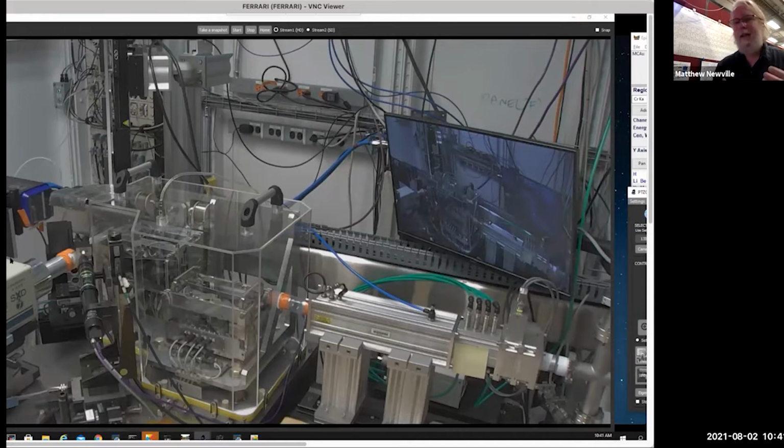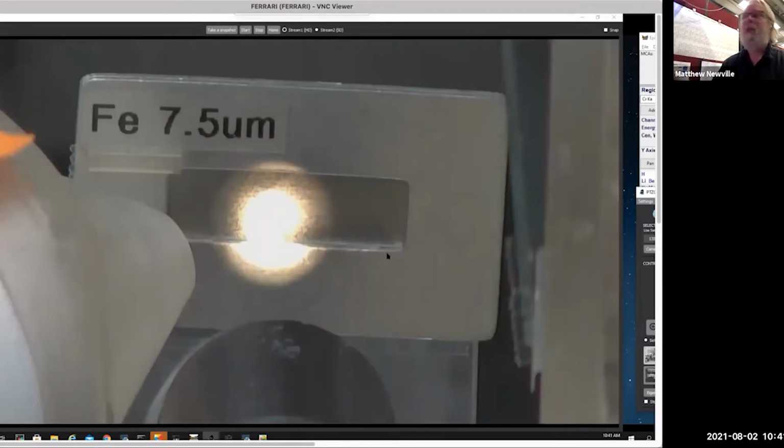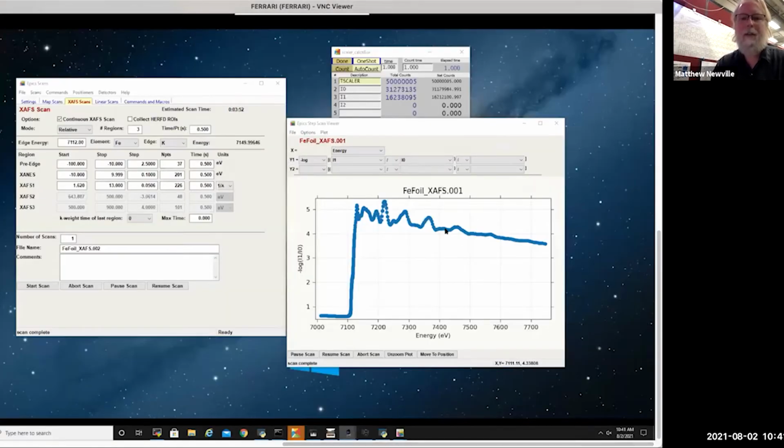The I1 chamber that we have is 100 millimeters long, and it's filled with pure nitrogen. So they're not matched at all. I think that many observers would say it's better to have them matched. At the APS, it's just not that important to get a really good measurement of I0, because I0 is so huge. You always get a decent measure of I0. It's good to have the match for harmonic rejection. For this setup, I know the harmonic rejection is done by mirrors upstream. For most of the work at this beamline, the harmonic rejection is done upstream, so it doesn't need to be handled by the ion chambers themselves. So that's our iron foil XAFS.